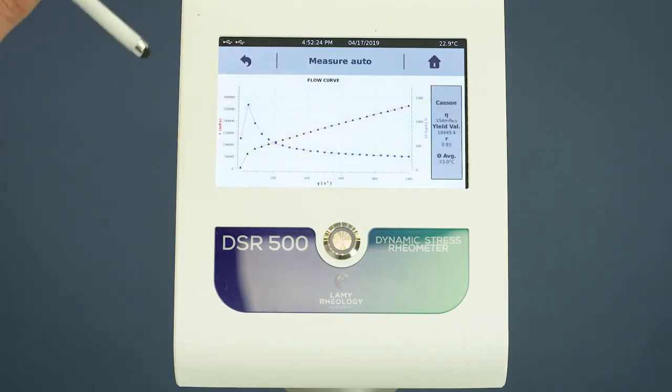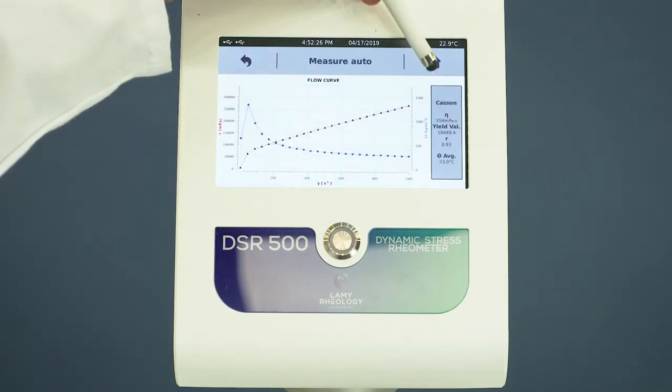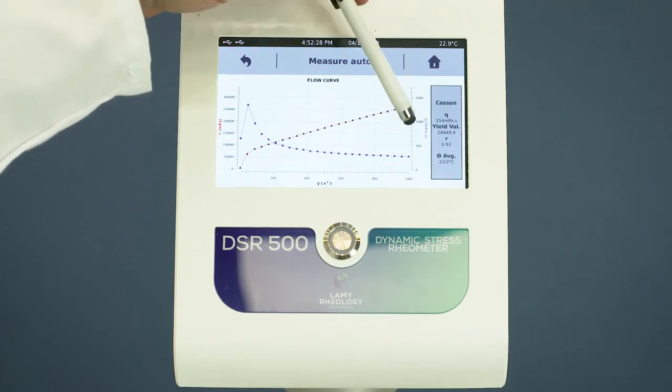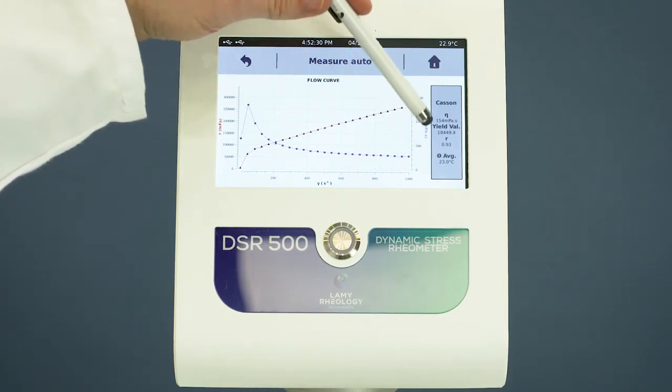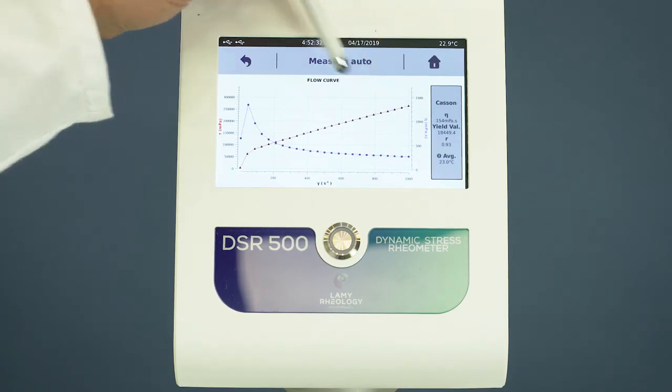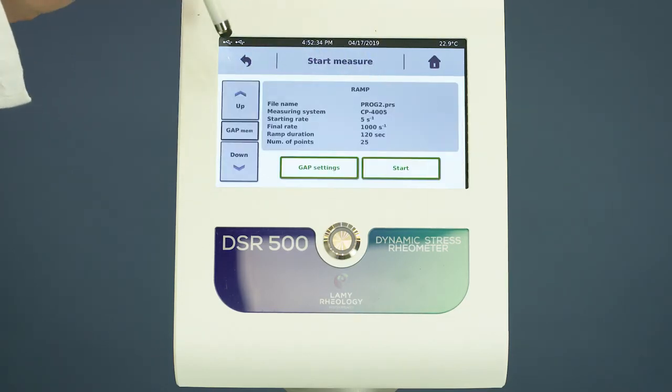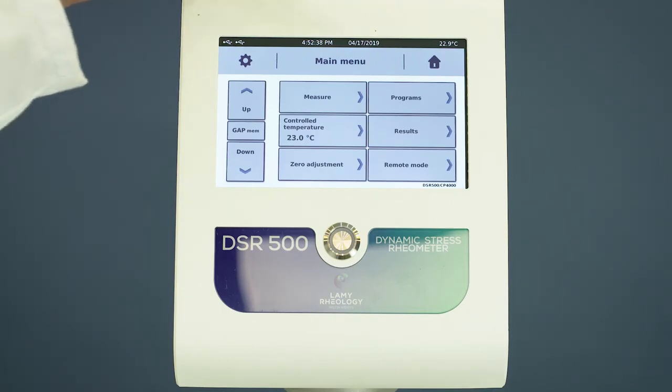Save the measuring file at the end and see the analysis result. A report can be printed directly. Go to the main menu to edit the saved file.